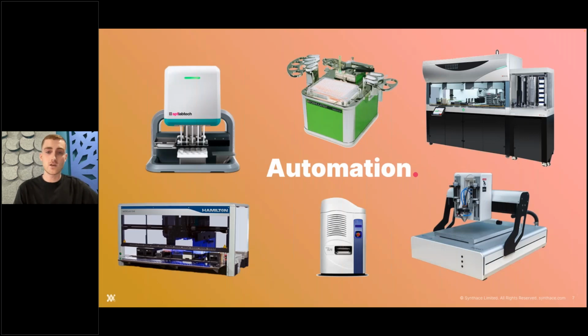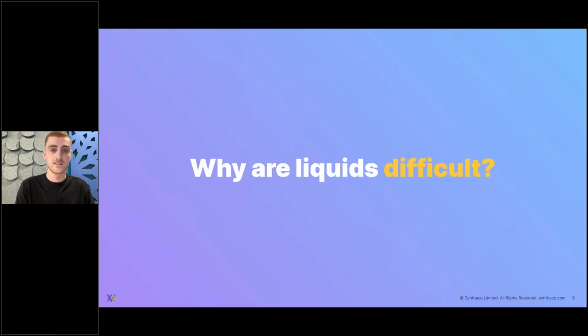Unless you're living under a rock, you've probably heard of automation. And if you haven't, I'd strongly suggest you check out the previous automation masterclass webinars in this series. You can find that on our Synthace YouTube channel, on LinkedIn. And what I mean by automation from a biology perspective is these liquid handlers and dispensers. I call them robots because it makes my job sound more interesting, but they're effectively just these brilliant bits of kit that move liquids around.